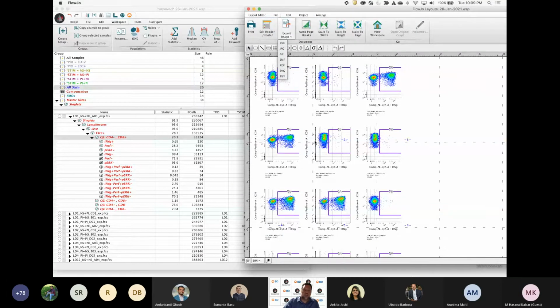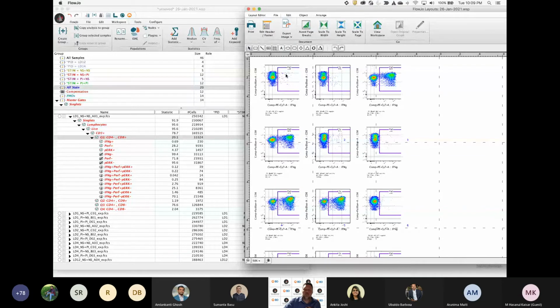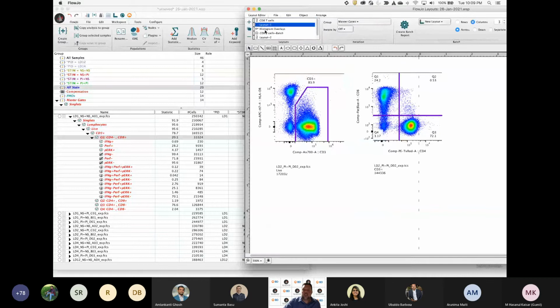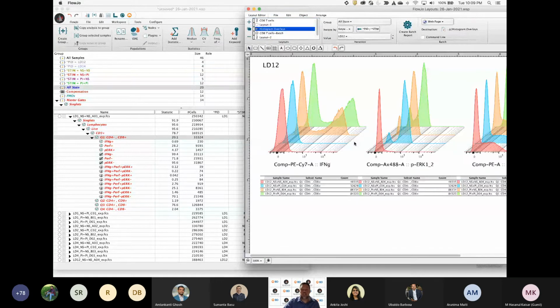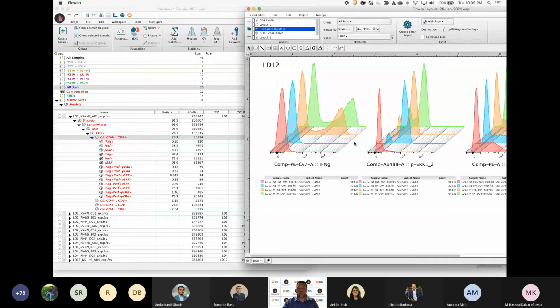Now, all of these options can be used in combination with each other, but those are the core that you're going to use in almost every single analysis, is reviewing gating initially and then making some focused descriptions or representations of your data to go along with the story that you're presenting to your audience in a paper or presentation.